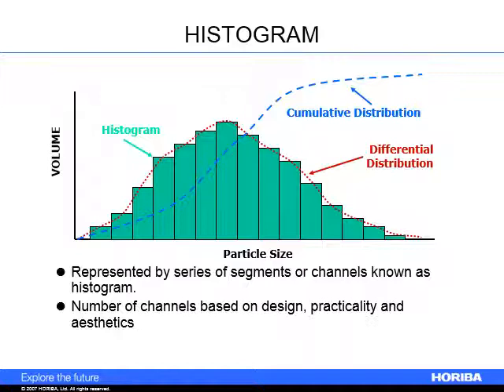This is your particle size histogram or distribution. This is the output from a laser diffraction particle size measurement. It basically breaks everything down into little bins or channels. That's how it works, the different sensors, and it brings it up like this. It relates it by size versus volume. That's the standard way of doing it. You can change some of the channels. You can set things up a little differently. This is just what your output will look like.